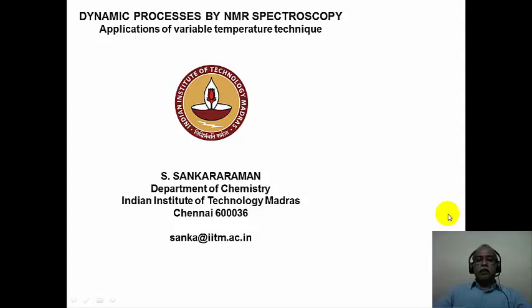Hello, this is module 14 of the course on application of spectroscopic methods in molecular structure determination. In the earlier module, we were discussing the study of dynamic processes by variable temperature NMR spectroscopy and saw several examples of restricted rotation, conformational changes, and so on.